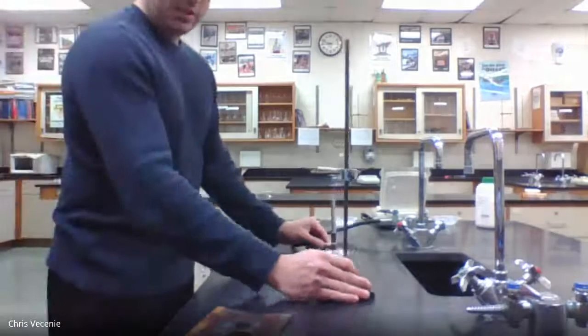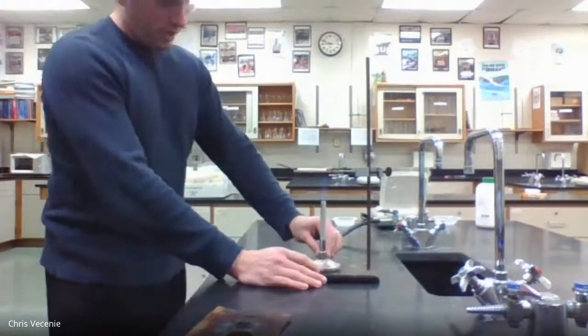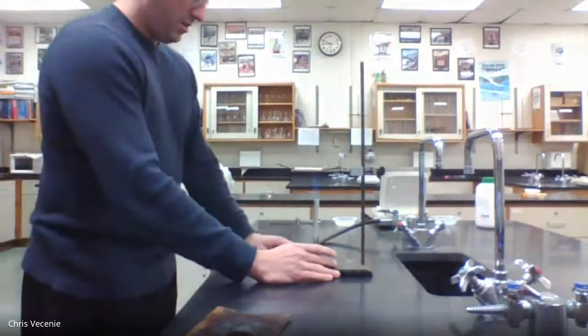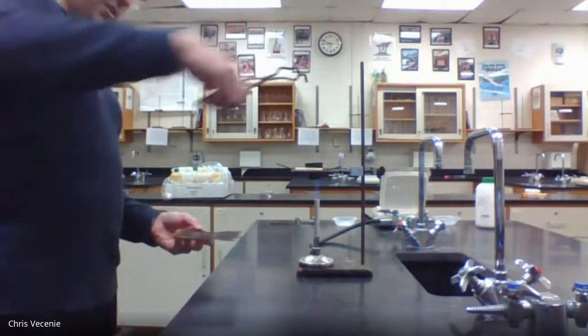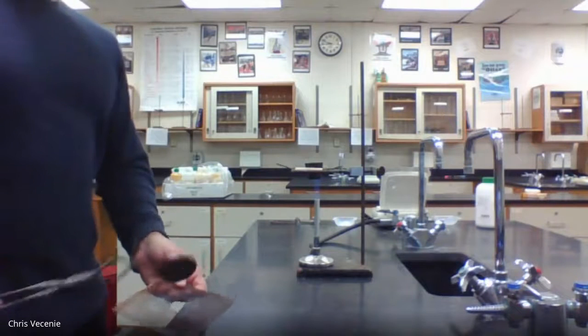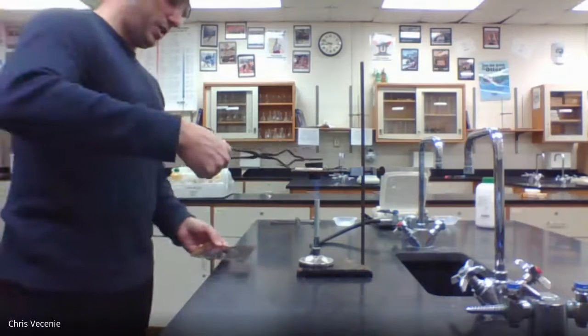So I'm going to take this over here, and I'm going to turn it sideways so you guys can see. All right. Looks like we have a good height there. All right. Just taking my crucible, putting it in here. Taking my lid and putting the lid on top.